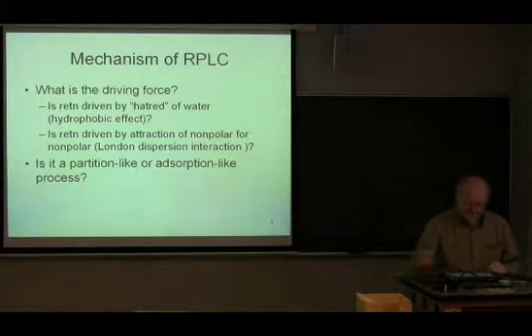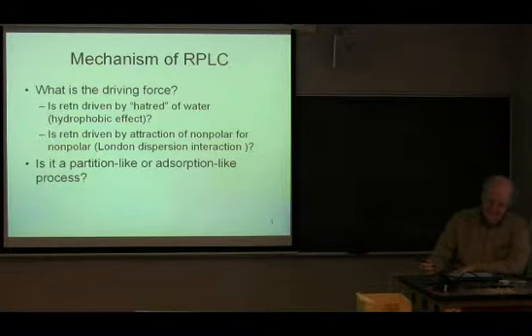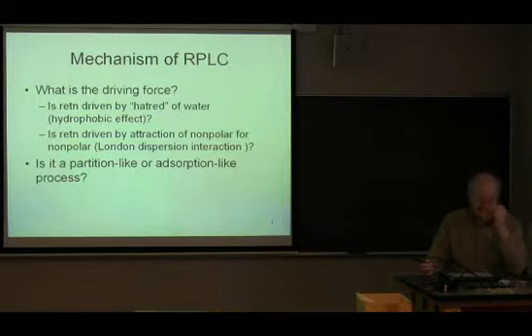Okay, so the two big issues in my opinion right now in terms of understanding reverse phase liquid chromatography is, A, what makes it happen? What is the driving force for solutes to go from a polar eluent into a non-polar liquid? And there are basically 2 theories about this. And they're both old.